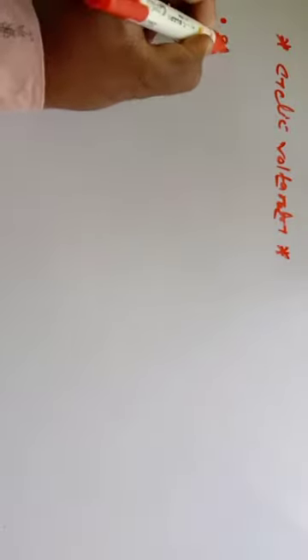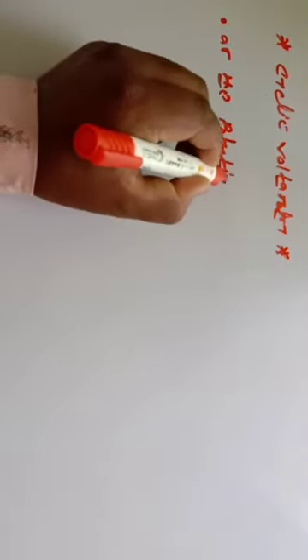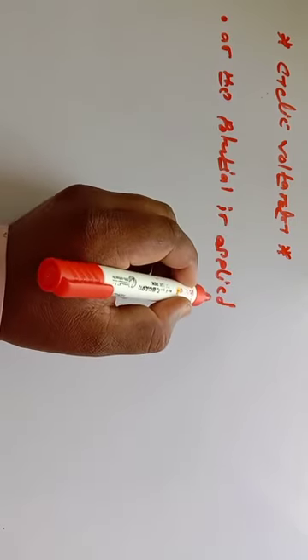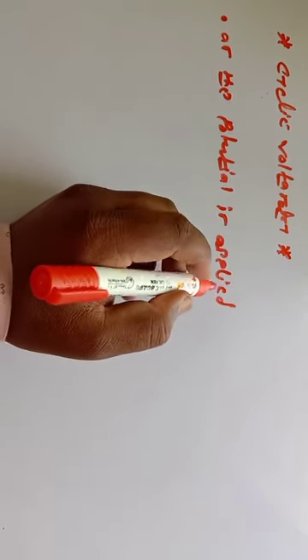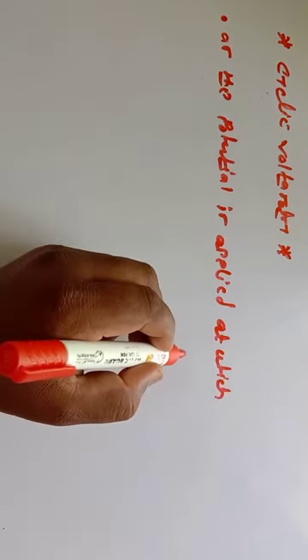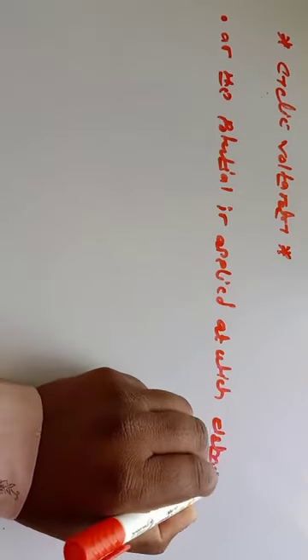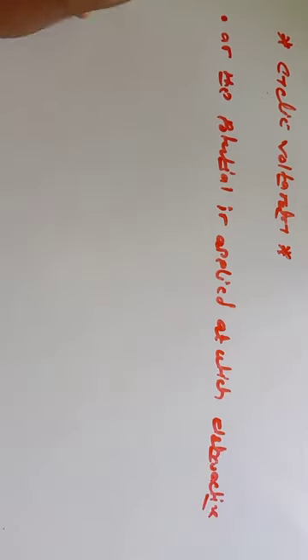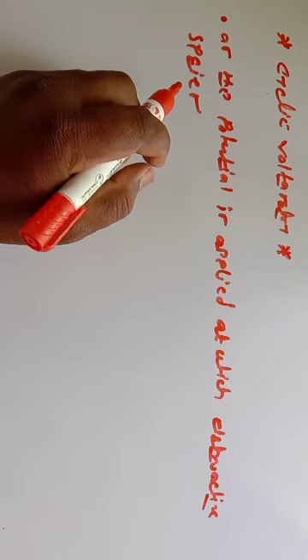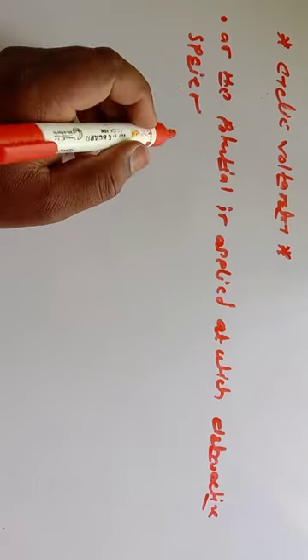As the potential is applied at the working electrode, the electroactive species, meaning the species which undergo oxidation or reduction, start to react.